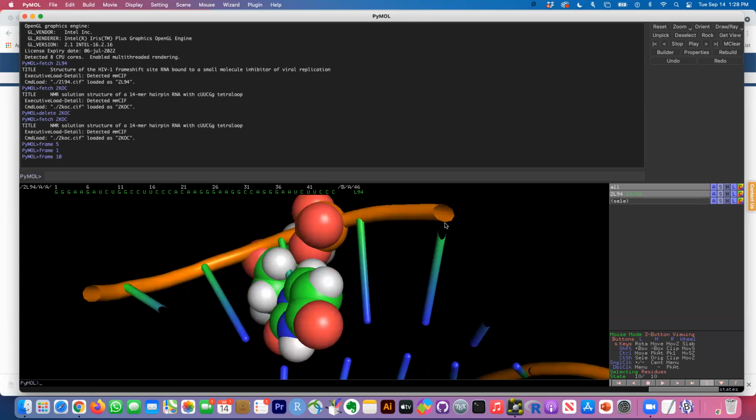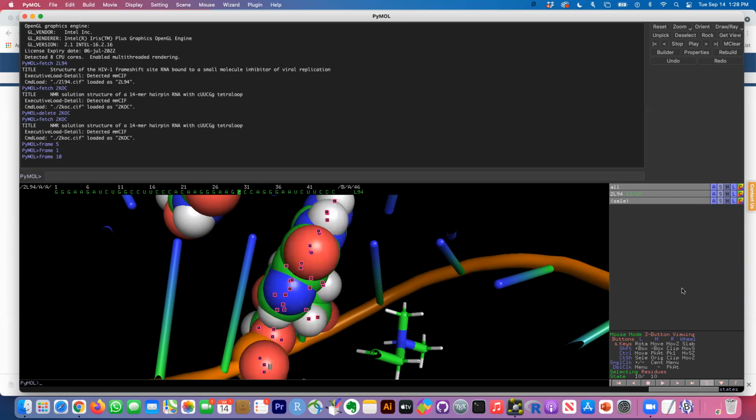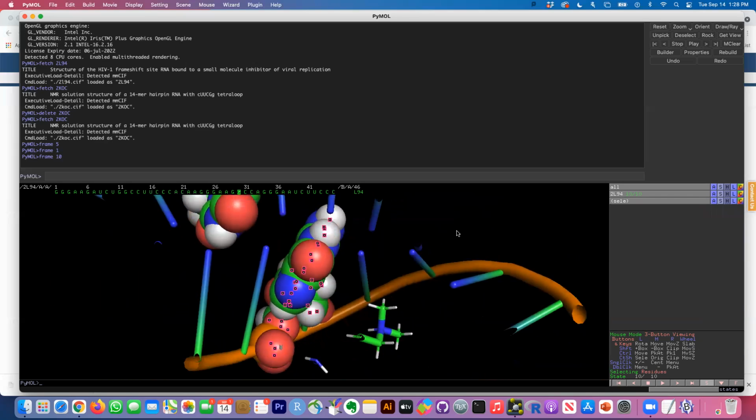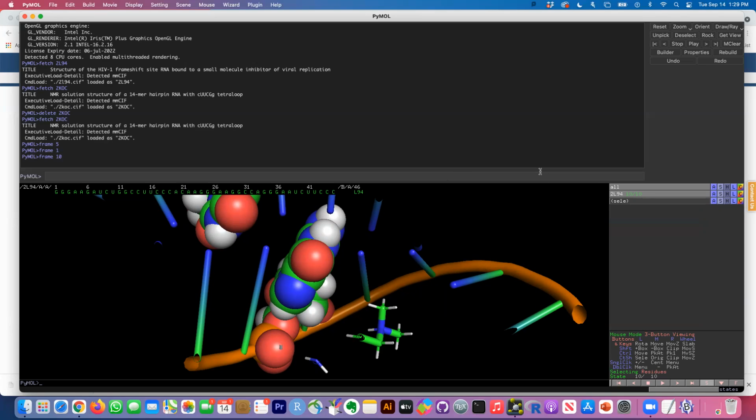So try this out yourself. Click on any particular residue, zoom in on that residue, and then change your representation to a sphere. And again, for those of you who are following along, let us know if you were able to do this. And then Liz, give me a sense of how many people give thumbs up and whether or not you think I can continue.